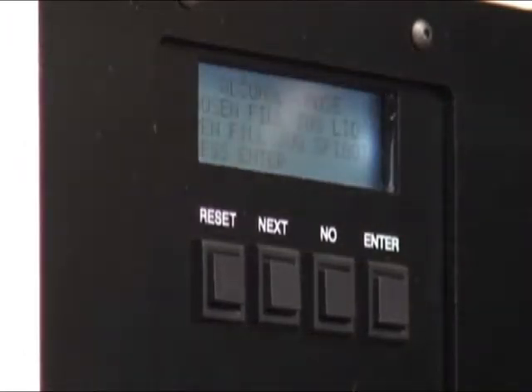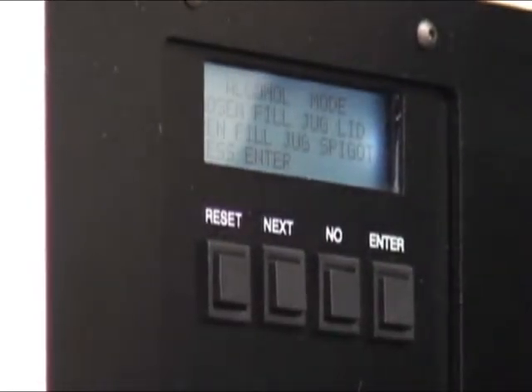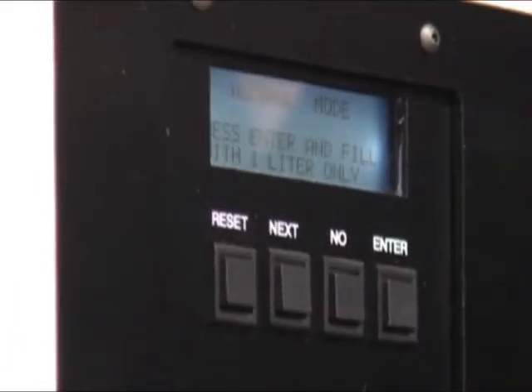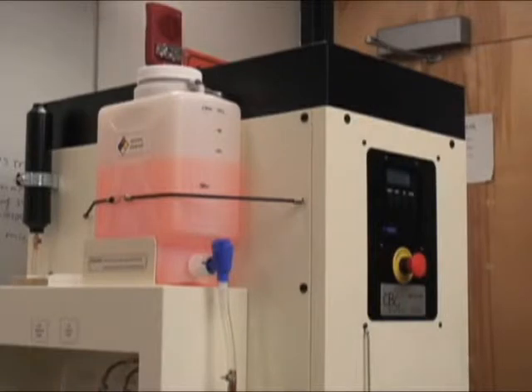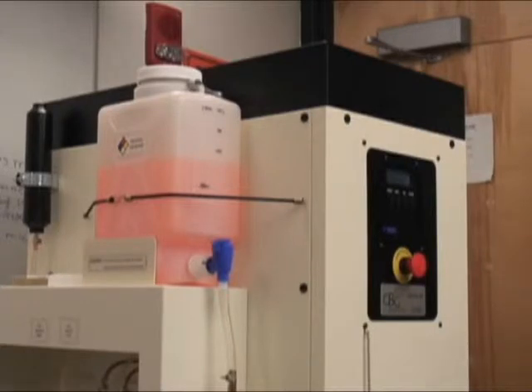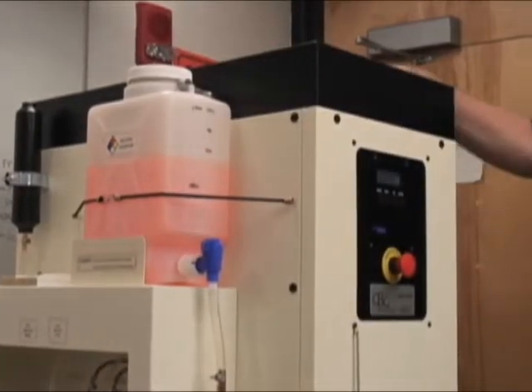There it is, ready to go. It says alcohol mode — loosen the fill jug lid, open the spigot, and press enter. It says alcohol mode, press enter and fill with one liter of solution. This is the liter I told you about. All you have to do is stand here about ten more seconds. If we were doing this, you'd allow one liter to go in — stand here for a moment, about ten seconds. Let the liter go in. As soon as you see the liter go in, it says press enter and stop the filling for flush. I'm going to press enter, and now I'm done. You can now walk away from this unit — you leave this open, which it would be, you leave this loose. And you're ready to go.